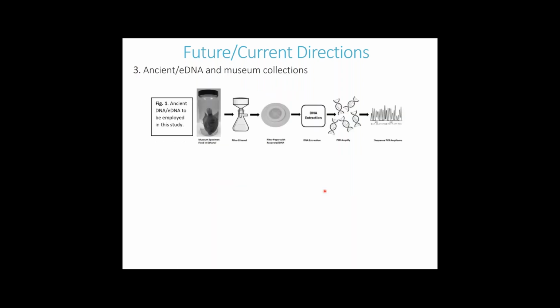And finally, one thing that I'm really interested in: I'm also curator of our vertebrate museum here, so I have a sort of museum background. I've always been interested in trying to extract DNA from type specimens or valuable, older specimens. As you might expect, most curators don't want you cutting off a piece of a fin of the holotype or paratypes. So I thought, well, let me see if I can extract DNA from the ethanol storage fluid. This is only for ethanol-fixed specimens, which are pretty much pre-1900 specimens. They were fixed and preserved in ethanol. They've never been in formaldehyde.